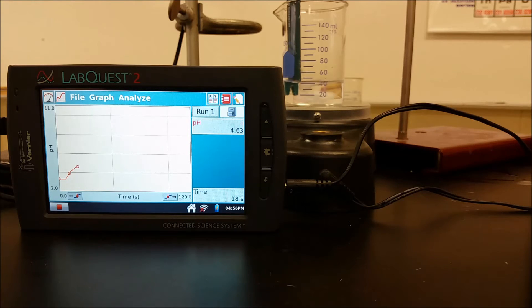What we're going to see here is that the color is not going to change from colorless into pink until we get to that equivalence point. So by choosing an indicator where the pKa is very near to what the pH is at equivalence, we get a much better correlation between the endpoint and the equivalence point.